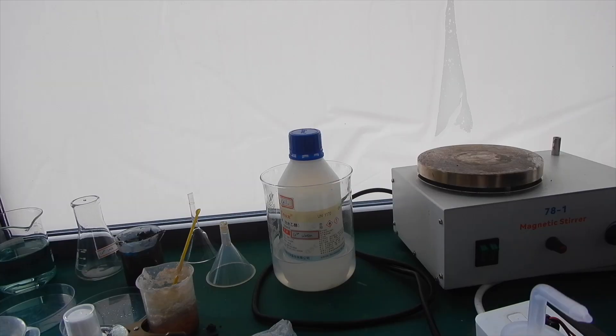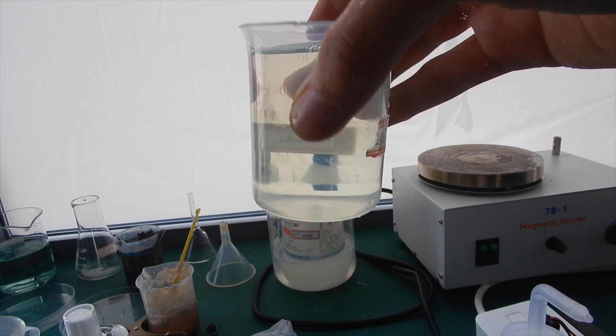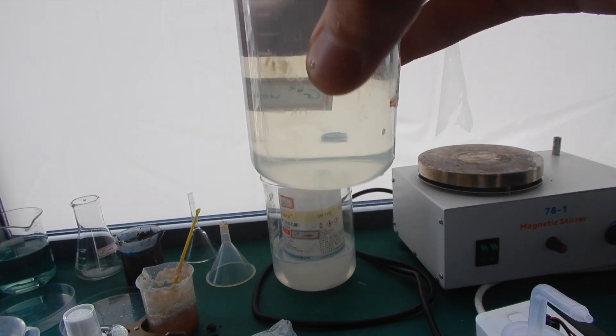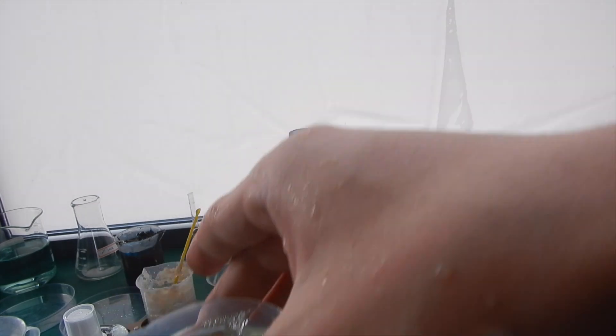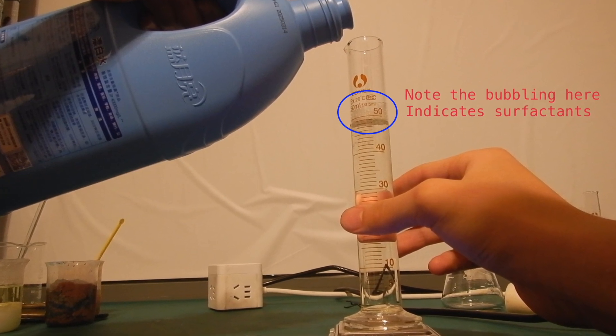When I came back, I poured everything out and sadly there are no signs of reaction. The color of the bleach was still there, and there was absolutely no signs of layer separation. Upon further look, the bleach contained some surfactant impurities, which probably explains why it didn't work.